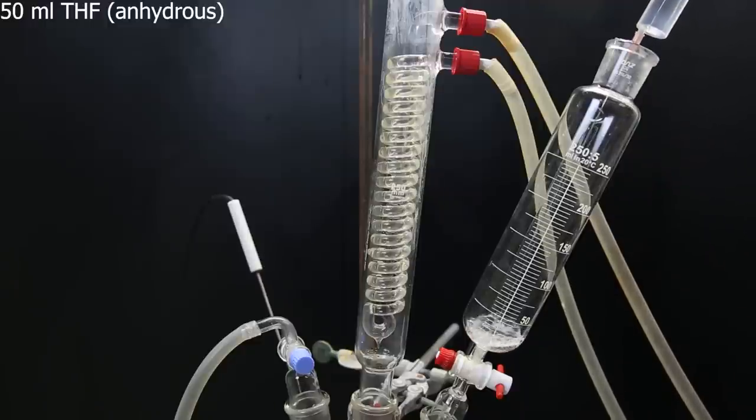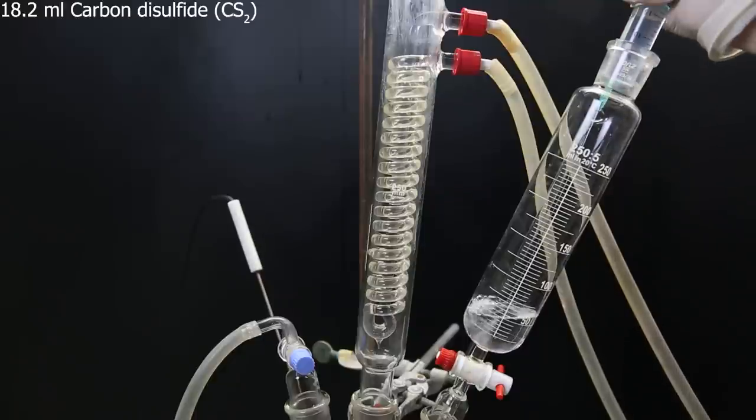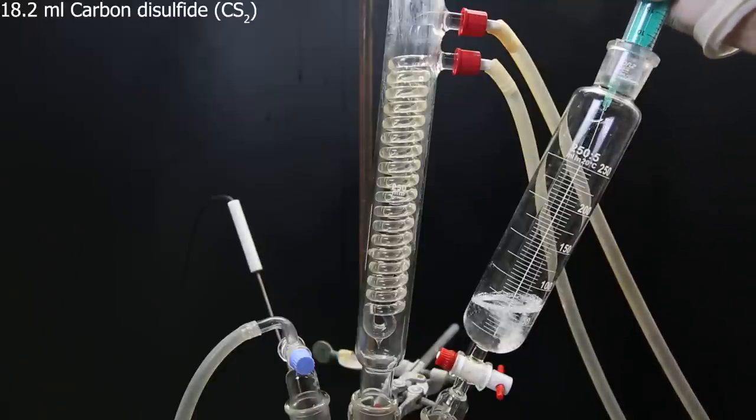When that is done, I start the nitrogen flow again, and open the dropping funnel. I add 50ml of anhydrous THF, and then dissolve 18.2ml of carbon disulfide into it.